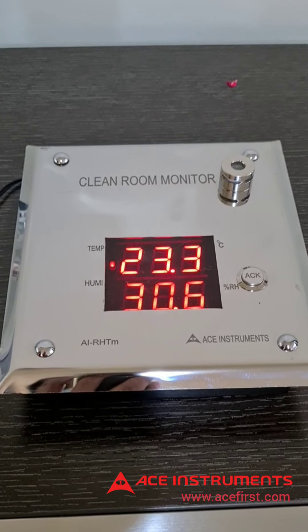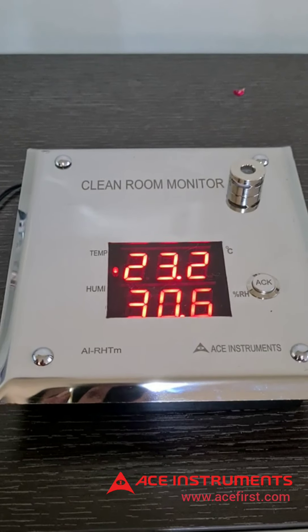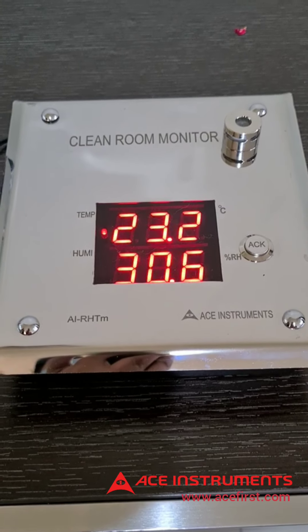The instrument works on 24 volts DC and has an optional two analog 4 to 20 milliamps retransmission outputs — one each for temperature and humidity. This is selectable only at the time of ordering, to enable the analog signal to be taken to a PLC or a SCADA system.